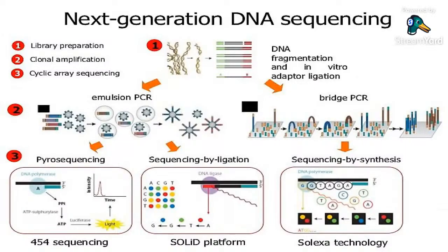Then we have attached adapters to the ends of these fragments. So why do we attach these adapters? This process is basically enabling them to efficiently amplify and sequence our DNA that we have extracted from our sample. After library preparation, we'll go for the sequencing.